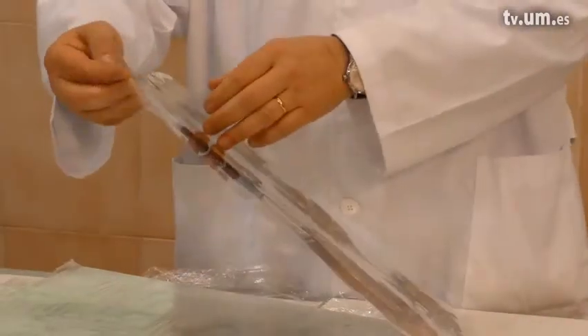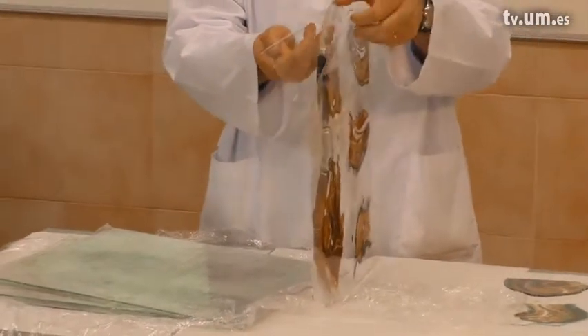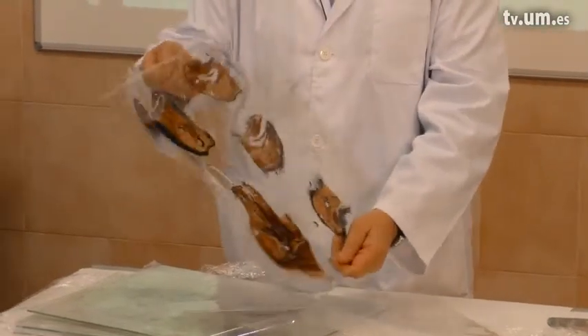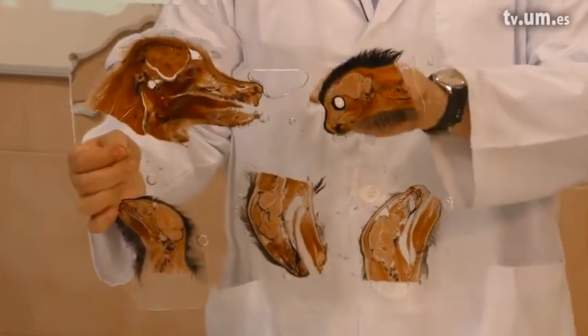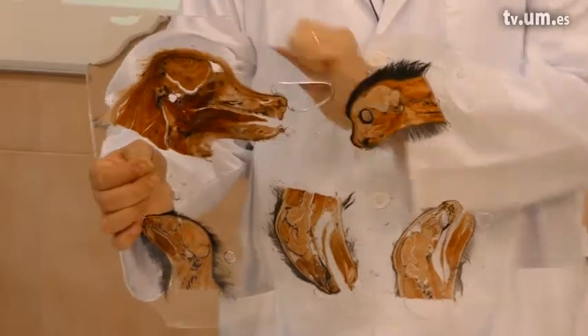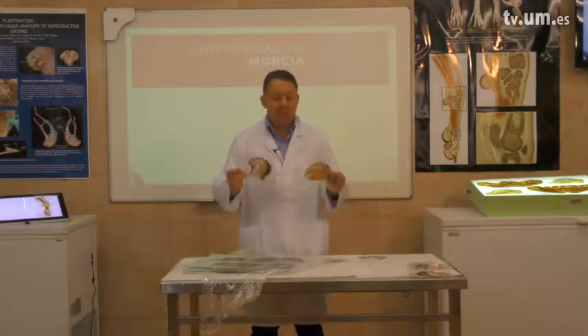So how do we open it? We just have to pull apart the foil, and when we pull apart the foil, the epoxy plate containing our slices will be in the middle. It doesn't look very nice because we have a lot of air bubbles, but in the next step we cut around the desired specimen. You can see here — we've done this cutting.